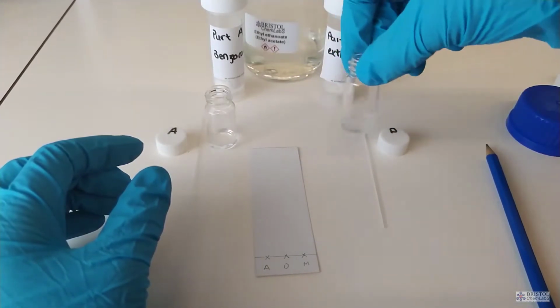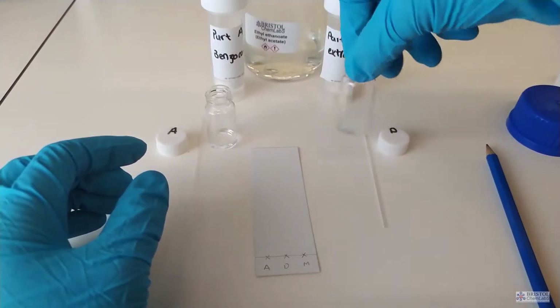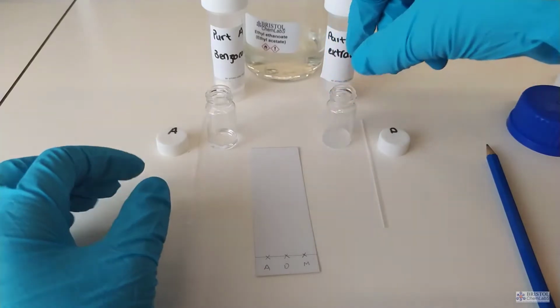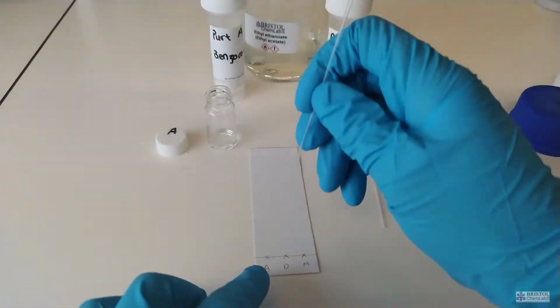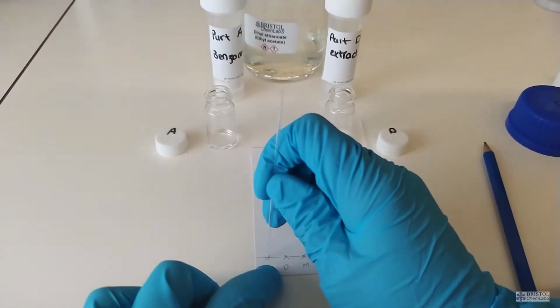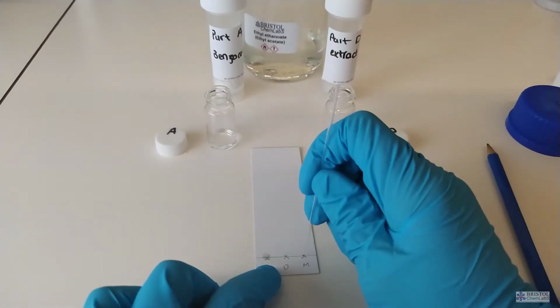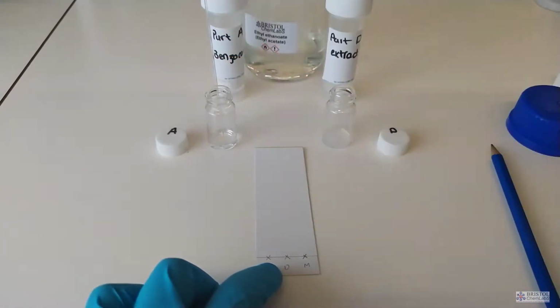We use a capillary tube to apply small amounts of the solvent solute mixture to the markings on the plate. We put several layers one on top of each other and try and make the spot as small as possible. We don't want large blobs because it leads to inaccuracy if we are measuring Rf values.